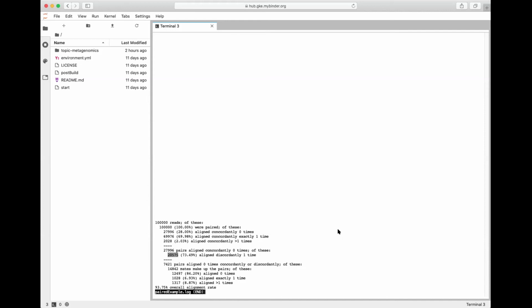These are not trimmed? No. Oh, okay, that explains it. All right, so I'm actually surprised that we're getting such high overall alignment rates. Yeah, I just remember, I was like, wait a minute, that's really, oh yeah, I didn't trim the data. That explains everything. Welcome to bioinformatics troubleshooting. This is how it works. Yeah, also that happened to me once. I was like, wait, why is this so bad? And someone told me, oh, did you trim the reads? Oh, no. Yep. Your instructors are not infallible, and it does happen to us as well. All right, cool.